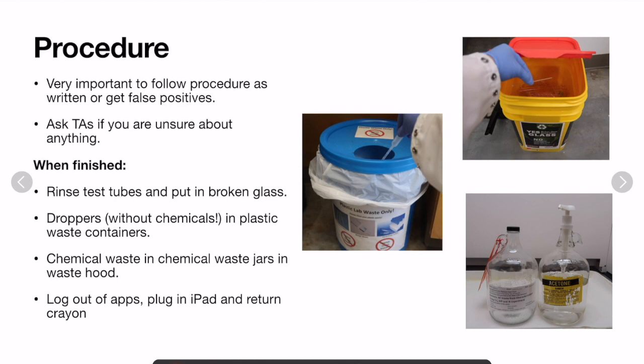A couple of notes about the procedure. It's a very simple procedure, but it's very important to follow it as written or you can get false positives. And as a reminder, do come prepared, but still ask your TA if you're unsure about anything.